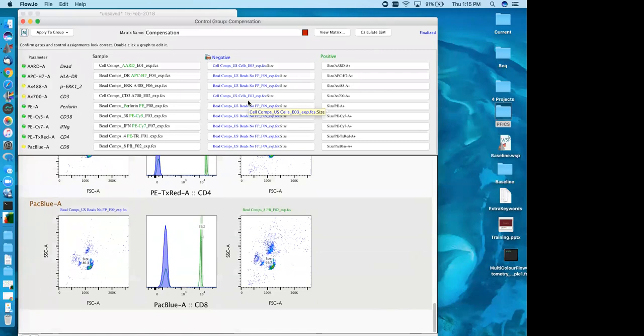And it's totally fine to use beads and cells in compensation in the same experiment, as long as you make sure you match up beads as negatives with beads as positives, and cells as negatives with cells as positives for a given color. As long as the same particle is being used to define a particular population for the negative example and for the positive example, we're going to be able to calculate how much fluorescence of any given fluor spilled over into every other channel on a ratio basis. So the percent of the amount of signal that gets spilled over, once autofluorescence is normalized by using particles of about the same size and complexity, then we're good, and we can apply that to any other particle.